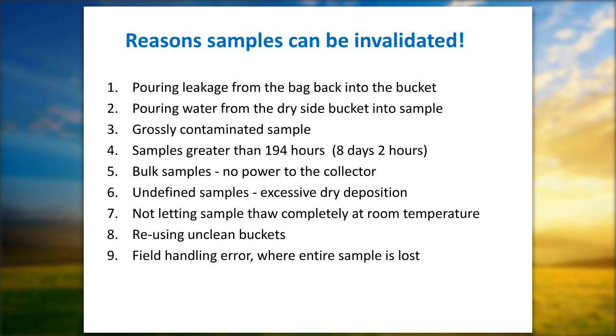Number 7 happens reasonably often, especially now that we're in the colder weather. When you have frozen precipitation, we require you to thaw it completely. You might say, well, gosh, why? I mean, there's liquid there. Well, it thaws unevenly, and you'll see this if you've got your drink or something. The cleanest water usually stays frozen, and it's the dirty water, the water that has the salt in it, that tends to thaw first. So it's not considered complete.